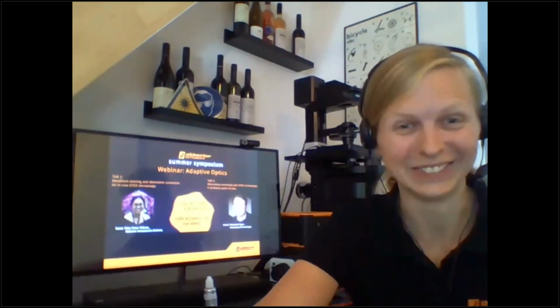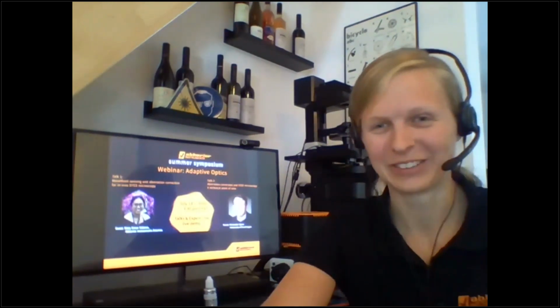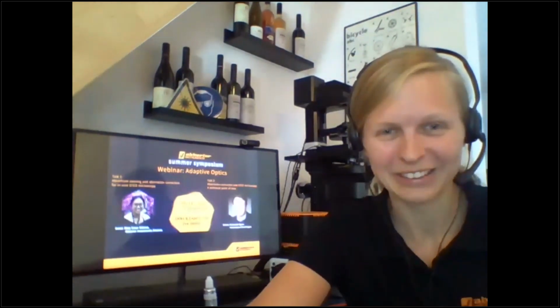Thanks a lot, Gero and Matthias, for these great presentations. I'm always quite impressed by how much better it just looks with the adaptive optics system turned on. And we got a lot of questions for your part. First question is, what is the maximum depth with the DM?